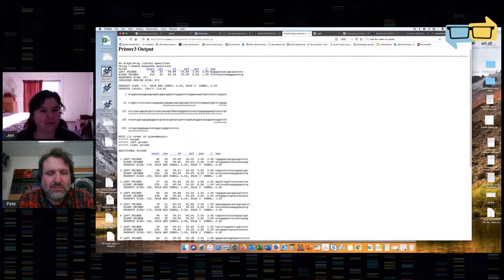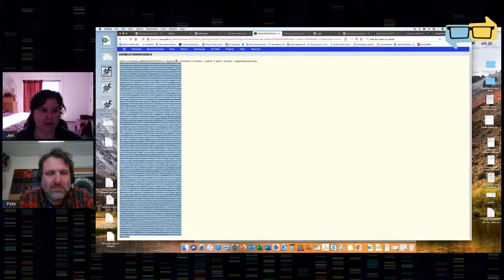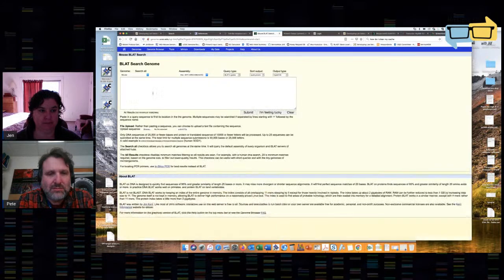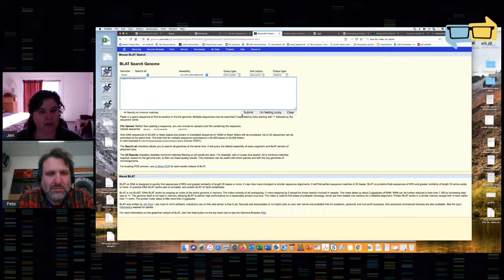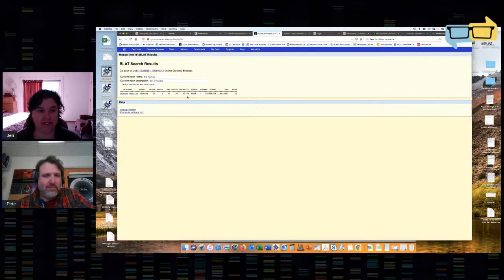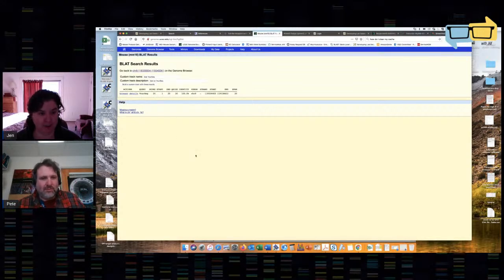I'm going to grab this first primer and make sure it's specific and won't cause any problems with strain background. I'm going to go back to the UCSC genome browser, go to Tools and BLAT, and put this primer in there. What I'm looking for is a single return. It is telling me that this primer sequence has 100% identity only on chromosome 9. If there were many hits stacked up, it would not be a specific primer — but this primer is looking really specific.